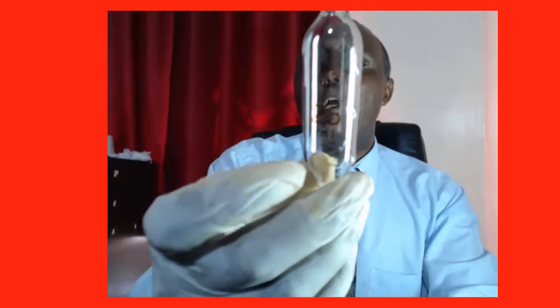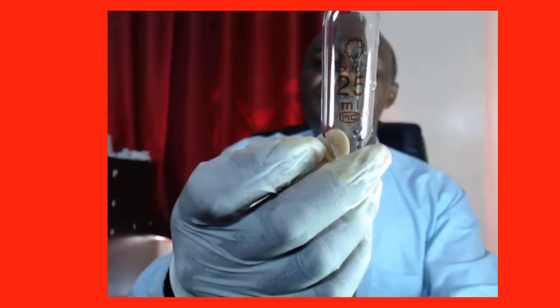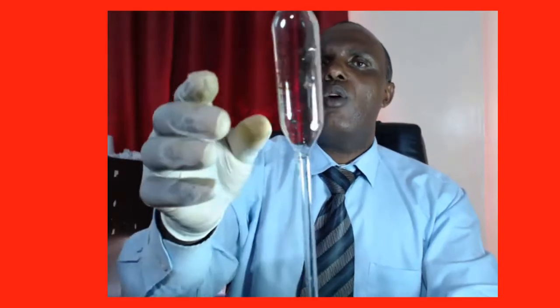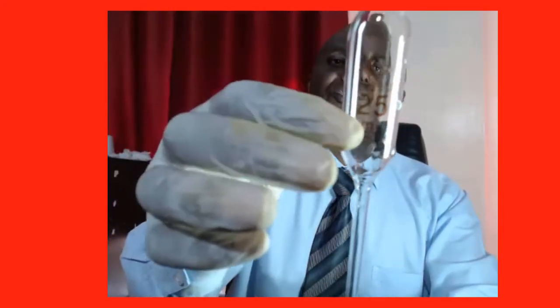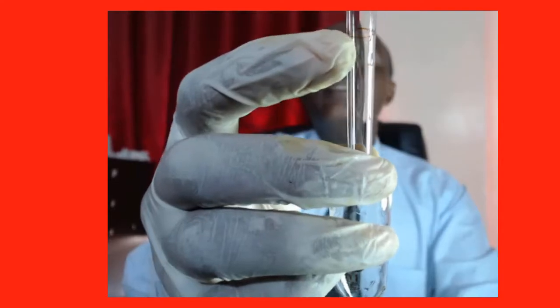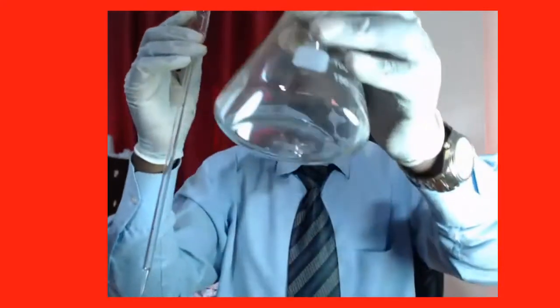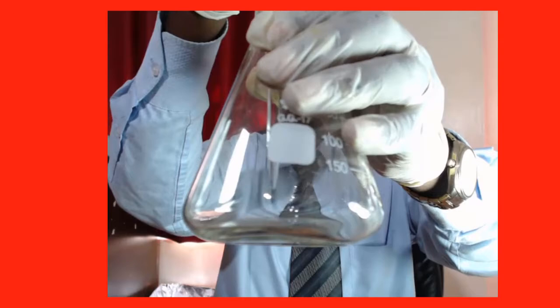The pipette that we are going to use has a capacity of 25 mL. So in this practical, we are going to suck up 25 mL, and when it reaches this mark, that mark indicates that the solution inside is 25 milliliters. So we will place that solution inside this conical flask.